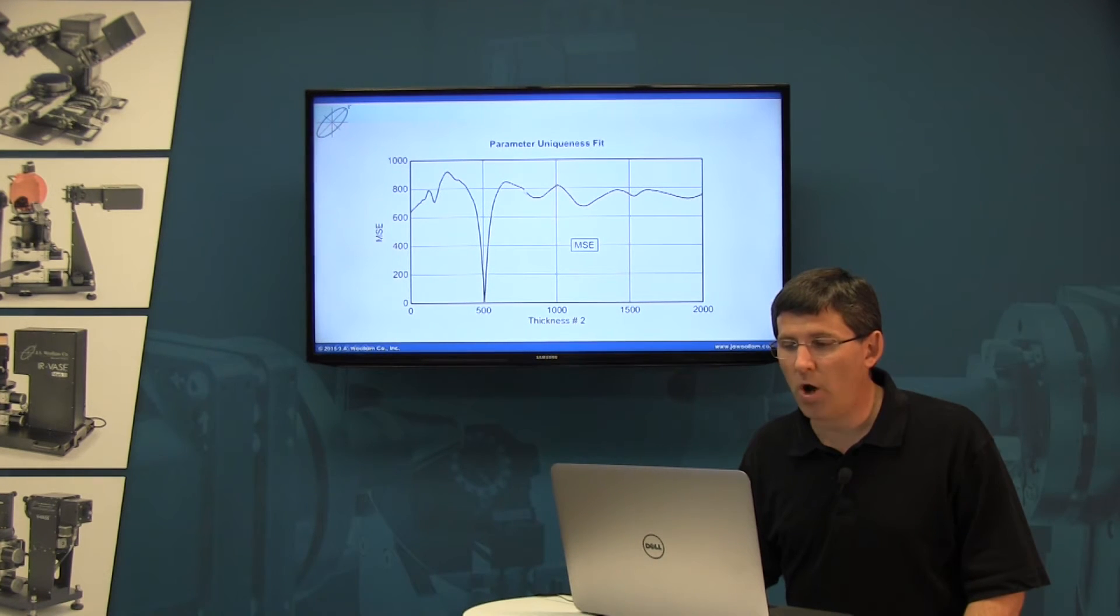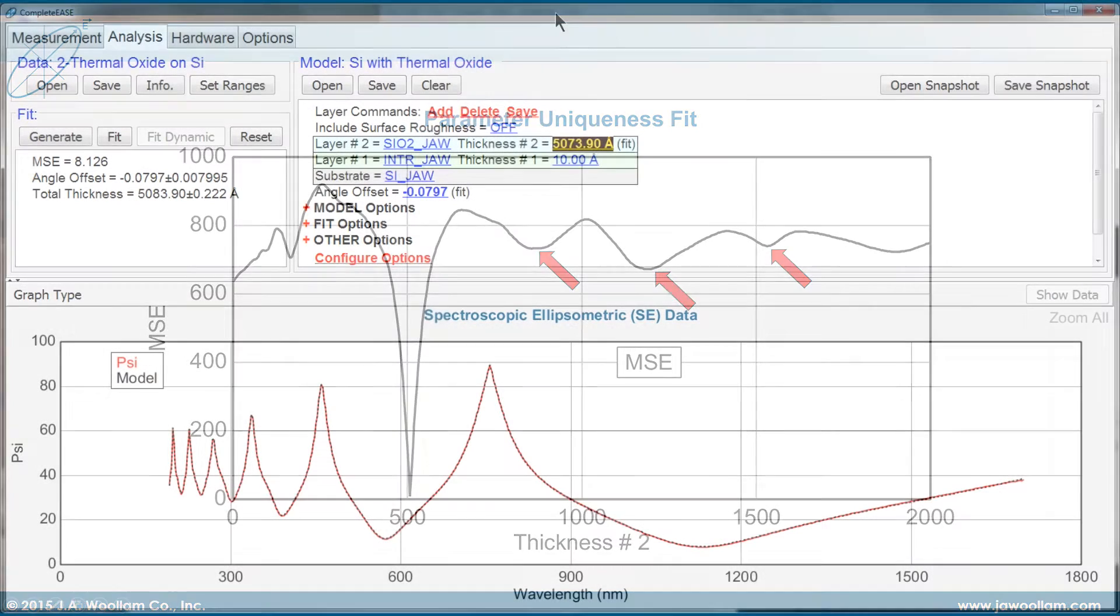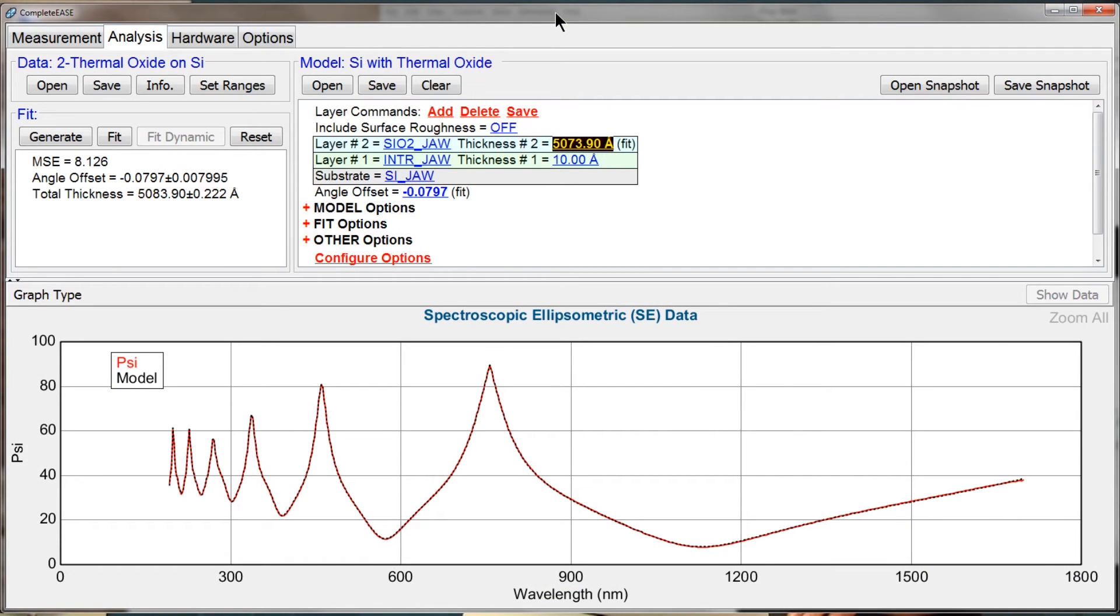But if I start the thickness at the wrong point, it's just as likely to find one of these other minima, which we call local minima. They're not the correct result. And I can demonstrate that in the software.